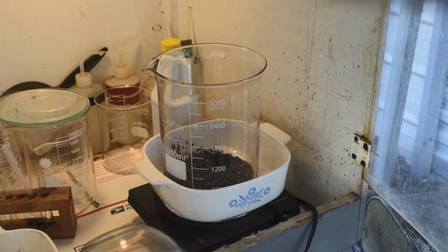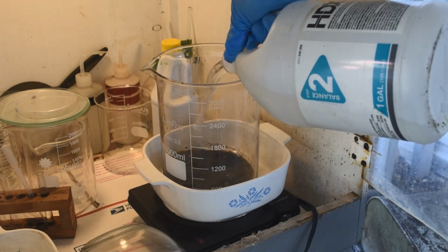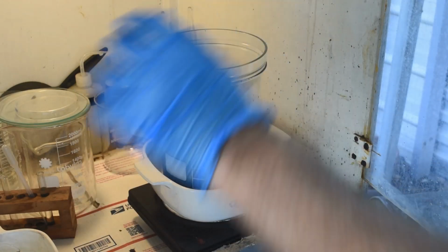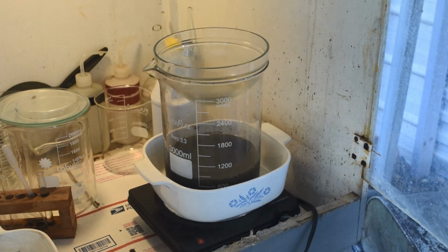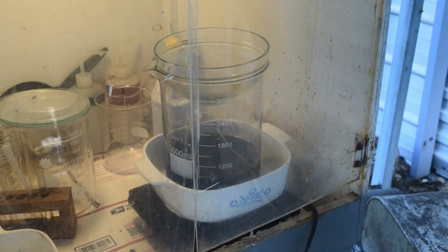All right, so let me get the fume hood going here. And get some more hydrochloric acid on it. All right. Put some heat to it again. Not too much. And we'll just let this cook for the next few hours at least, or until it looks like there's no more reaction going on.